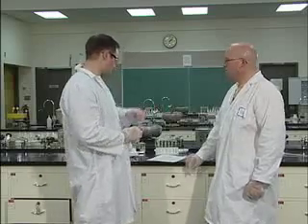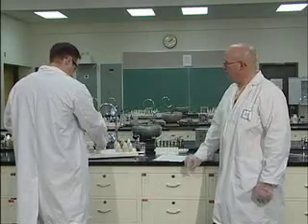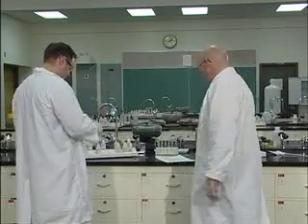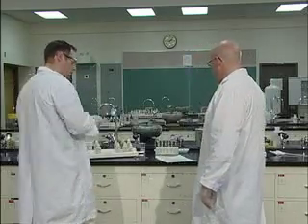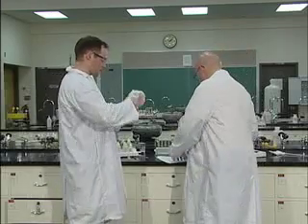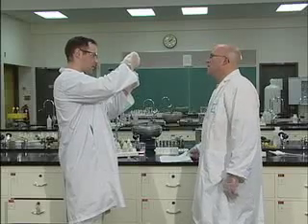Now we'll go through this one start to finish because it's a little bit more tricky than the other ones. So into D, you're going to put in 30 drops of sodium carbonate. So this is our double reaction. It's a two-stepper, both double replacement reactions. Exactly. This is a two-step double replacement reaction. So again, we're going to put 30 drops. This seems to be a common theme.